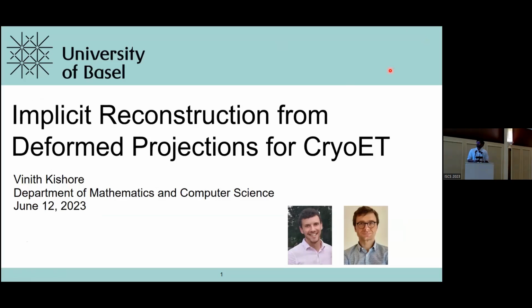As Emmanuel said, I'm going to talk about how implicit reconstructions can naturally incorporate deformations, which the previous speaker talked about, and also in the keynote lecture as well. But it's mainly applied to the cryo-ET problem.